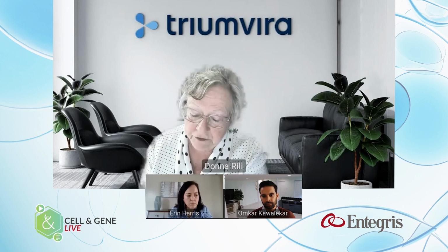And then when you get subject material that is varied, yields a variant, you can address how to best manage that. That's also helpful when you're trying to do tech transfer of your process to, say, a CDMO or CMO. Having that seed source material where you know the expected results with healthy donors lets you tech transfer across and make sure, at least as you transfer to a CDMO, that they get the basic process and get the results that you expect.